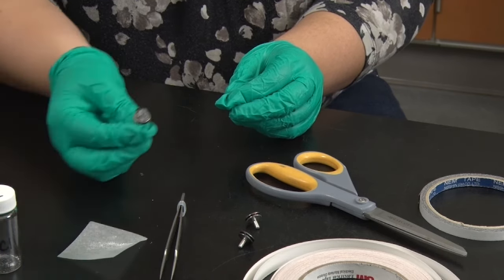If I let the water continue to form on the sample, the salt crystal will eventually dissolve into the water. I can force the salt to recrystallize by reducing the humidity in the chamber and allowing the water to evaporate. Once it does, the salt will form crystals again.